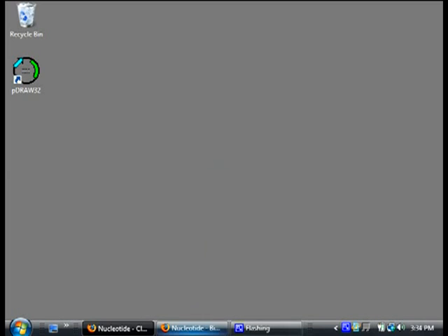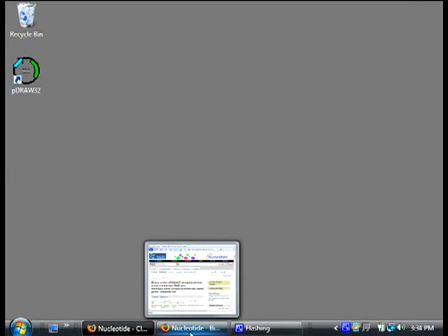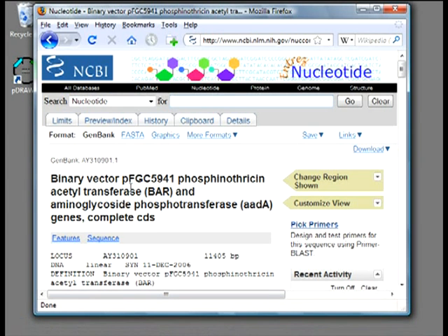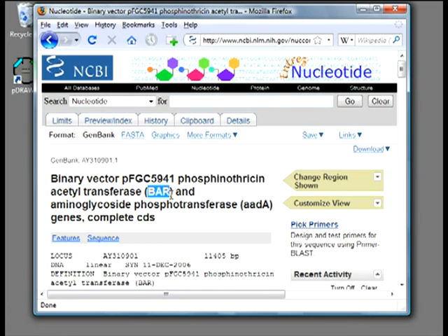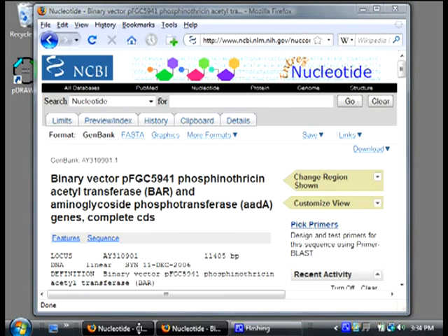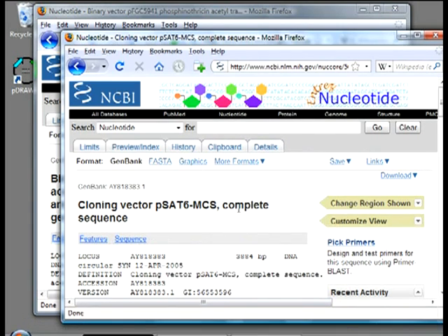To get started I go to PubMed Nucleotide and find sequences of PFGC5941, which I will use as a PCR template for bar gene, and of PSAT6MCS, which is the vector I will clone into.